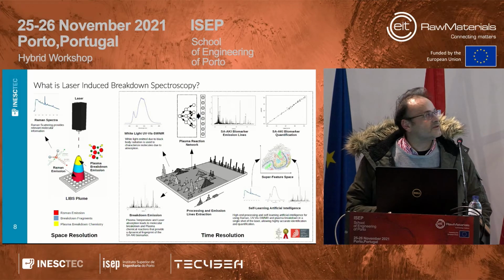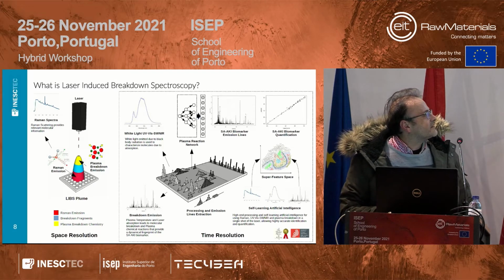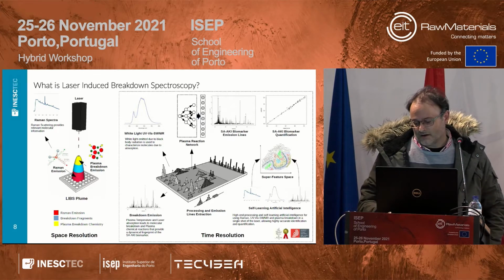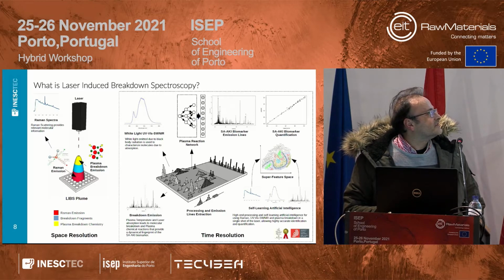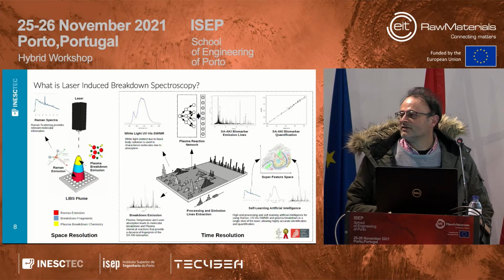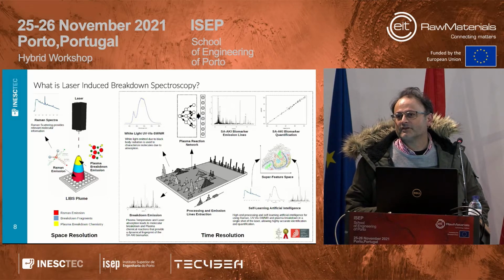And of course, regarding the time resolution, what this drawing tries to show is that not only do you have all those ions, but depending on the thermodynamical, chemical energies and kinetics of reaction, you will have this kind of plasma reaction network, and you will end up with different molecular lines and element lines seen, depending on the chemistry of the sample.